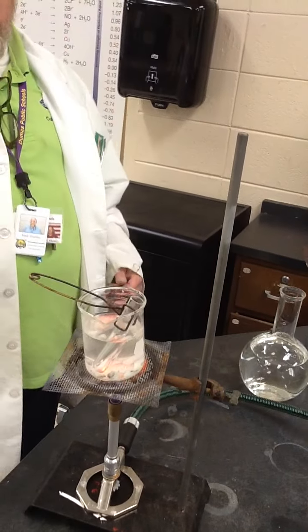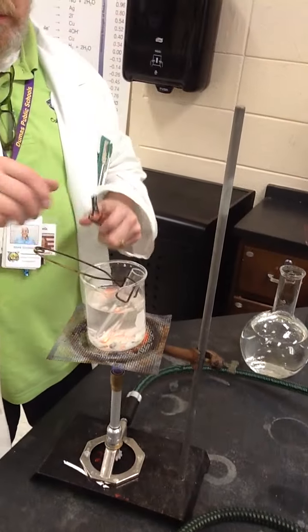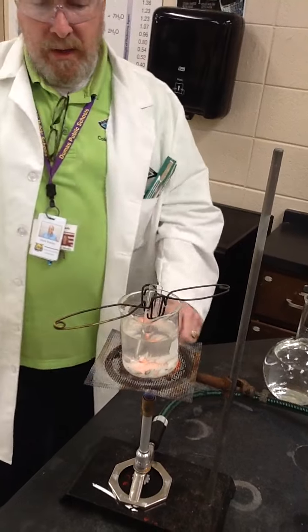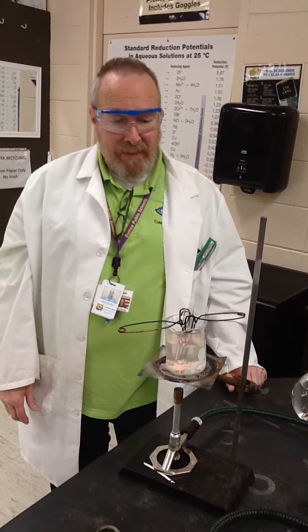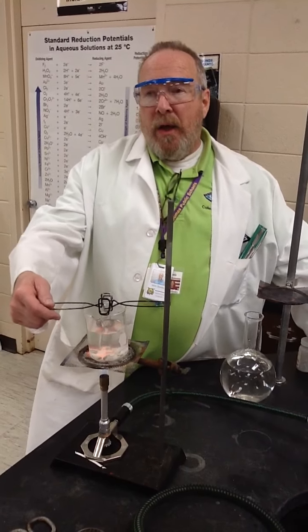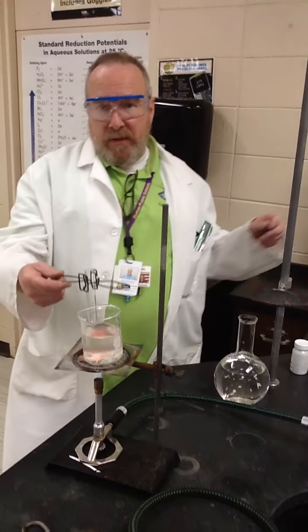And if you don't have too many tubes in your beaker, one thing you can do is take 2 of them together, span the beaker like so, and keep your tube suspended and upright in the boiling water. If you're going to boil a large sample for a long time, your water from the outside will heat your substance from the inside and boil it.